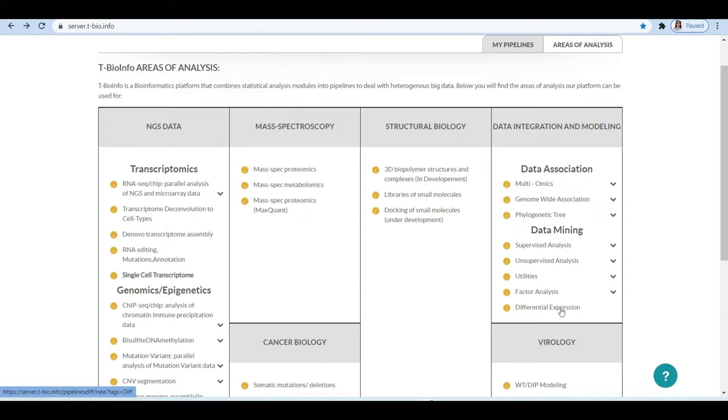In the previous lesson, we already talked about how we can apply the t-test and how we can extend the RNA-seq pipeline to differential expression pipeline.